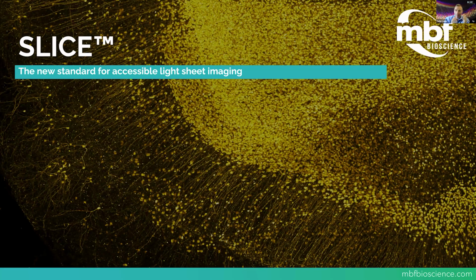Light sheet really has become a powerful tool for volumetric imaging of large biological specimens, especially in areas like neuroscience, developmental biology, ecology. However, many traditional light sheet systems require significant infrastructure, complex alignment procedures, and a very substantial financial investment.